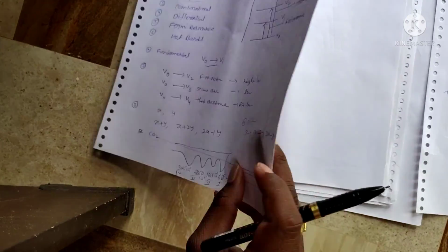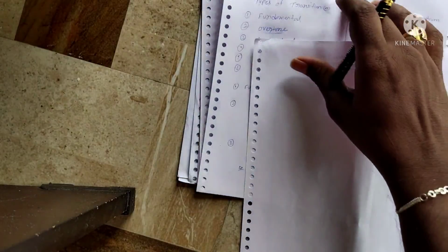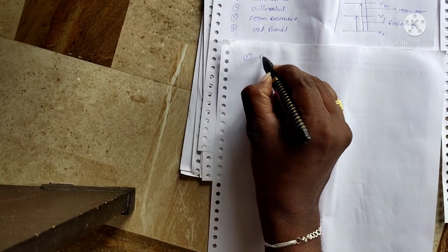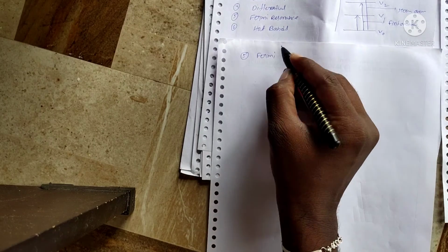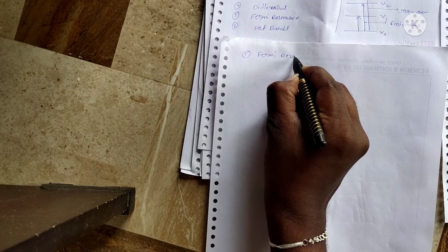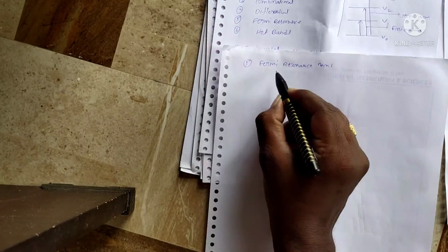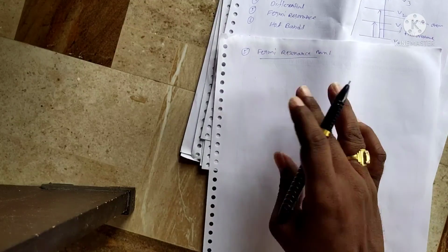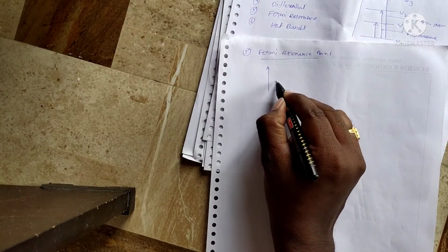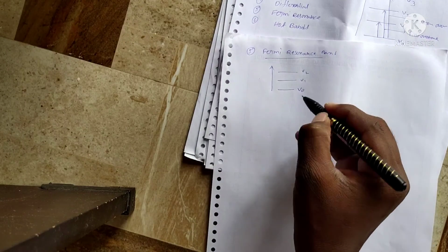Next, we come to the Fermi resonance band. What does Fermi resonance mean? See, this is the axis now. V0, V1, V2.